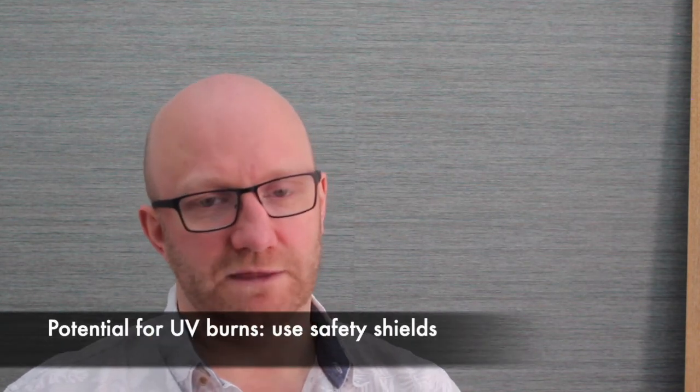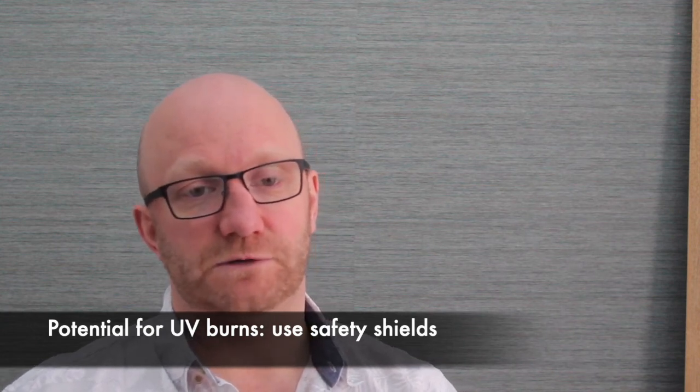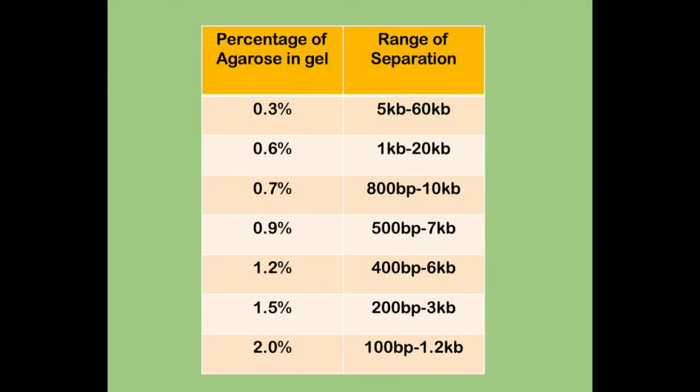And thirdly, we'll be imaging using UV light. UV light causes DNA damage, and your corneas are actually particularly sensitive. So the equipment in the lab will have safety cutouts, so you shouldn't ever be exposed to UV light. But when you're running gels in your own lab, you might be working with an old school transilluminator. So if you're doing that, make sure you're always using face shields, eye protection, and aren't exposing any of your eyes or skin to the light.